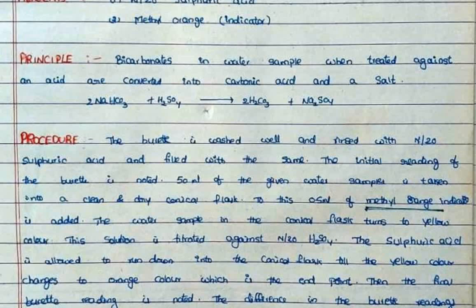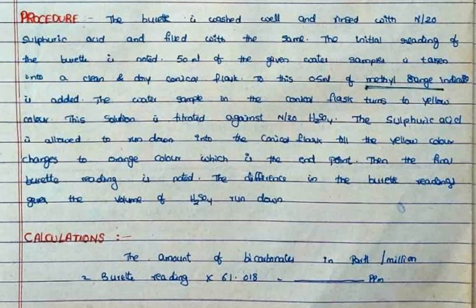Then the final burette reading is noted.